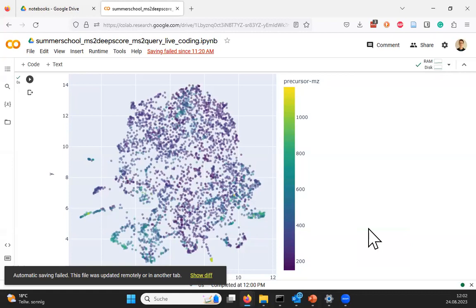Because you might see things that you will not immediately see in a network plot. For example, that there are some weird groups that are apparently very different from the rest of the compounds. I have to do amateur speculation here now. But then you can say maybe these are traces that don't belong there, or maybe this is a group of things that were added, or maybe it's something I'm looking for. And so that's exactly what I hope you could eventually get out of these plots.